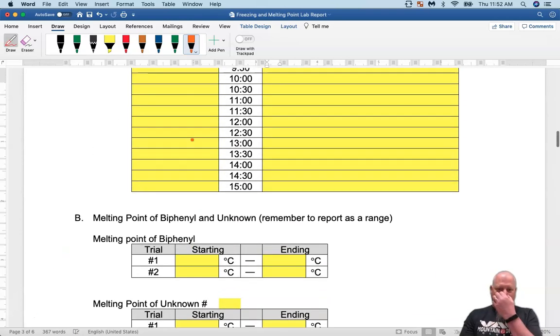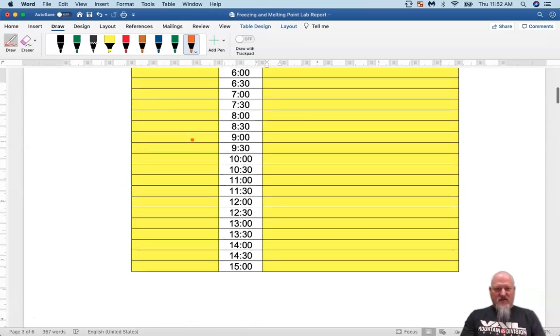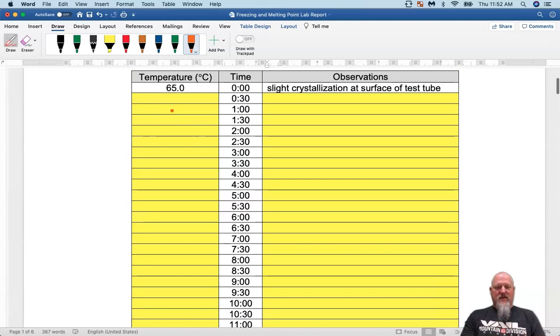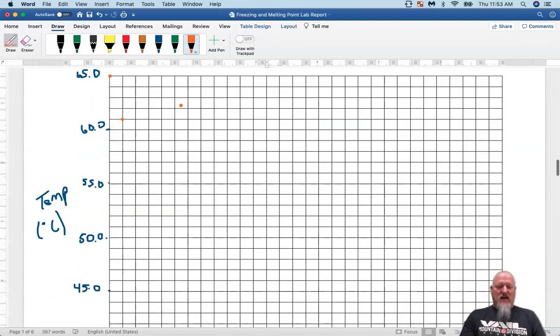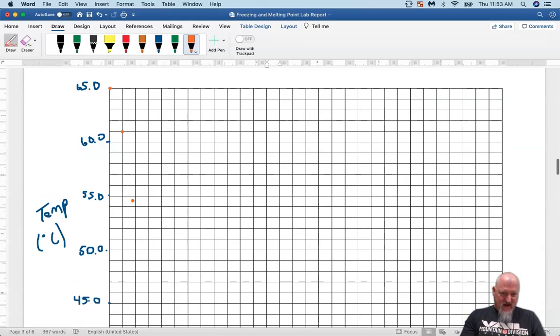And then for the next one, let's say my next one was at 1 minute, I read 59.5. Can't do 0.9. 59.5. So on the 1 minute line, 59 would be kind of here, right? Somewhere in between 59 and 60. Bang. So just like that.